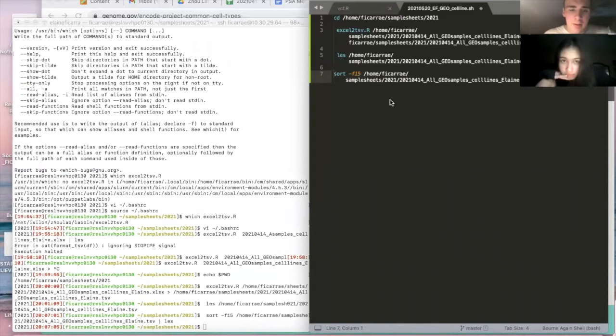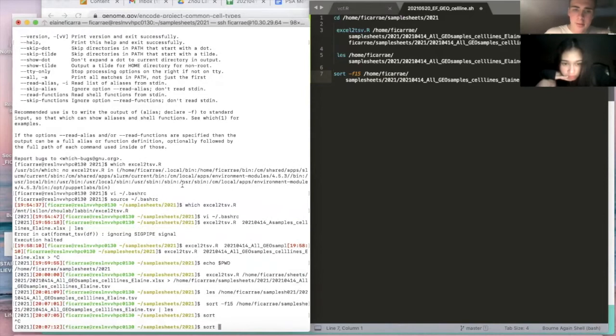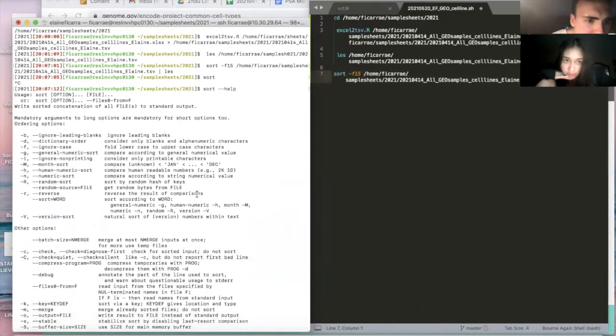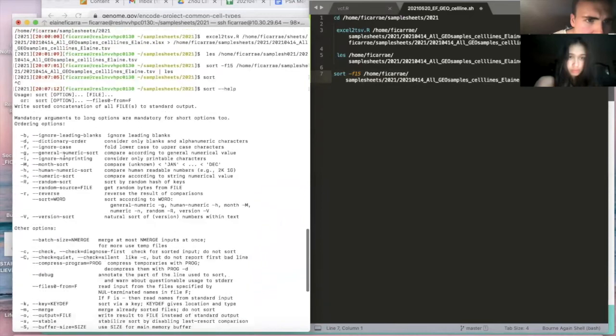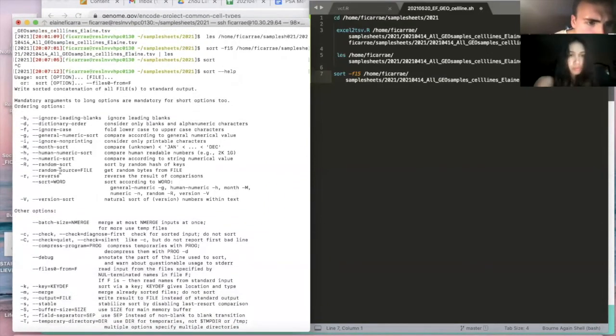It gave me an error. Am I imagining things? No, F is ignore case. Numeric sort.